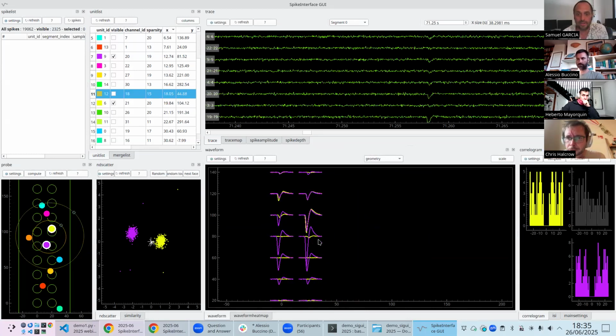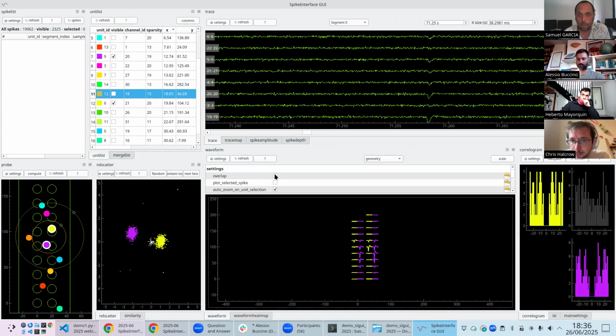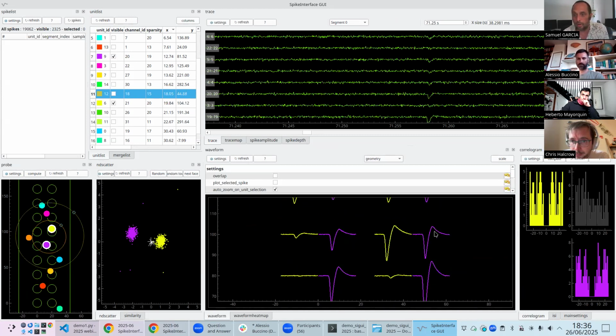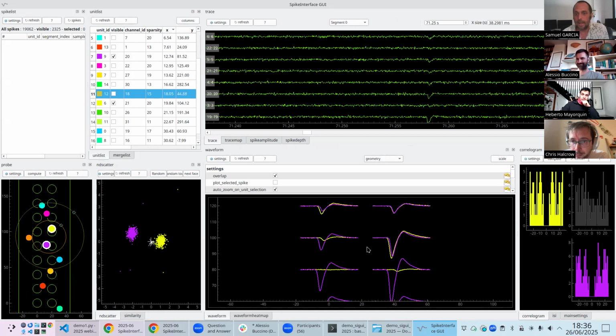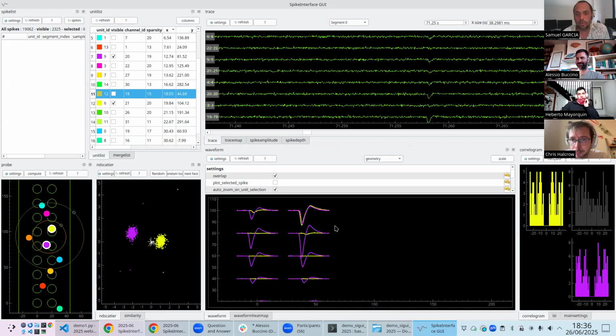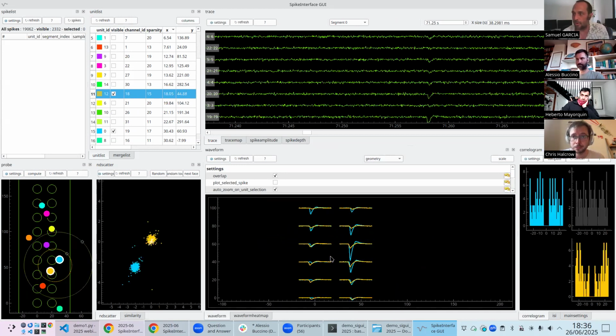So we have several ways to zoom in and out. One is to zoom with the mouse wheel, with shift or alt. Very importantly, you can overlap or not, or display side by side the 2 units. Merci, Alessio. It's incredible. You can do this. And the main idea of this is you want to discriminate: are these two guys different enough? It's the main question.